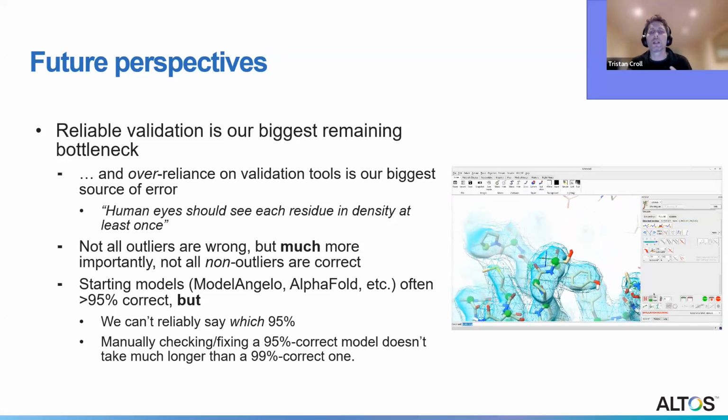And the reason I'm doing that is because our validation tools really aren't trustworthy enough as they stand. The reason for that is that most of the tools we have are about flagging statistical outliers.